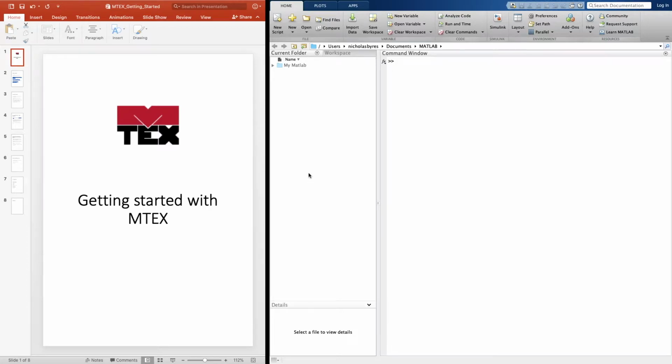This video has been put together to help new users of MTEX get up and running. Everything from downloading MTEX and installing it on your computer, through importing of EBSD data, and finally to using simple scripts to conduct some simple analysis on your EBSD data.